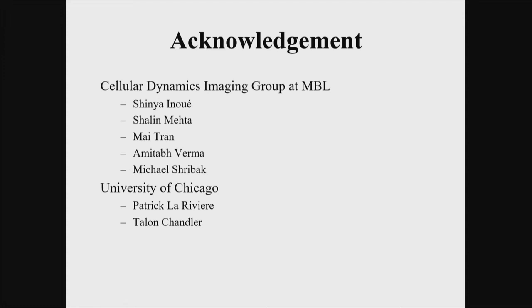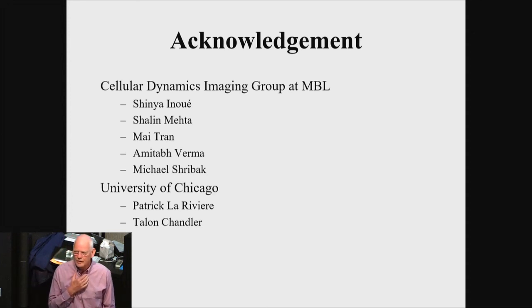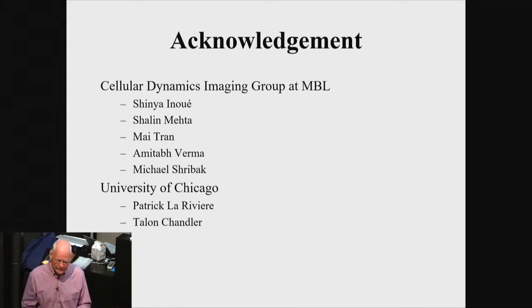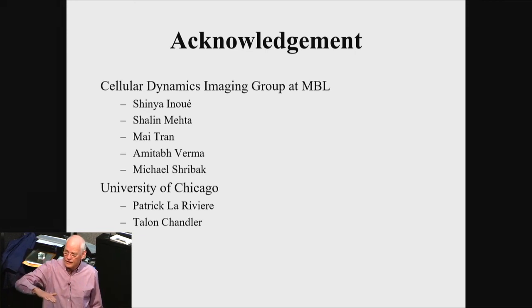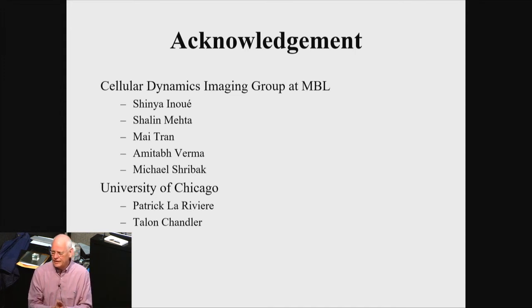Ariel. Yes, so I've also read about your, besides the multi-view, the multifocal approach that you have published. Can you tell us a bit about that? So Sarah Abramson has implemented that. She has worked with Mats Gustafsson, who really first implemented this way of generating several focal planes from a single setup, from a single focus setup in your microscope.